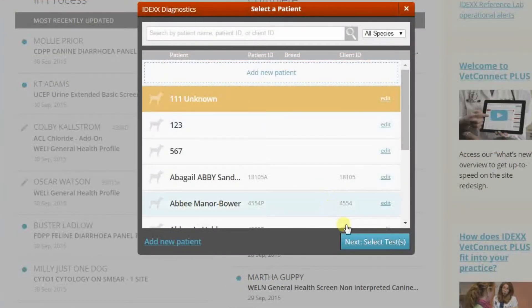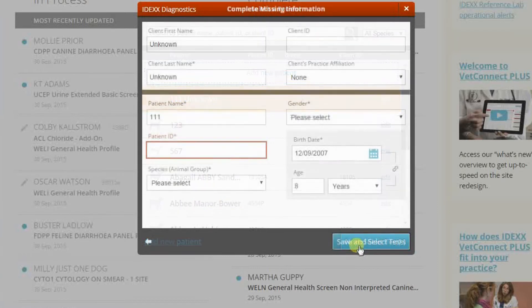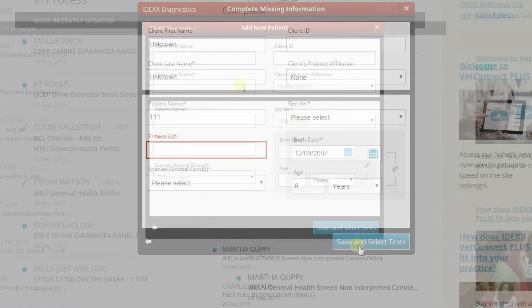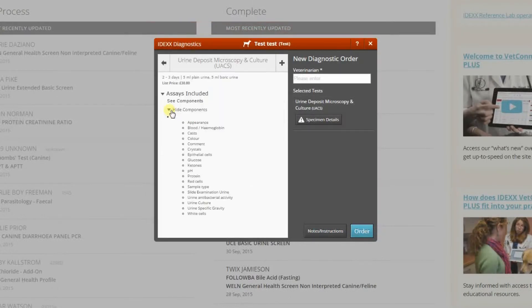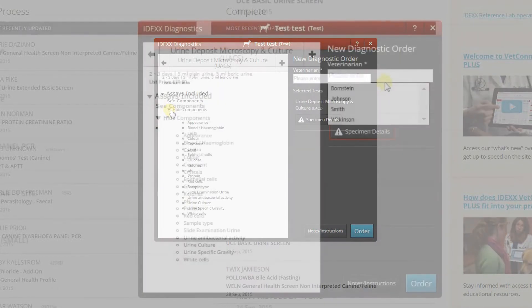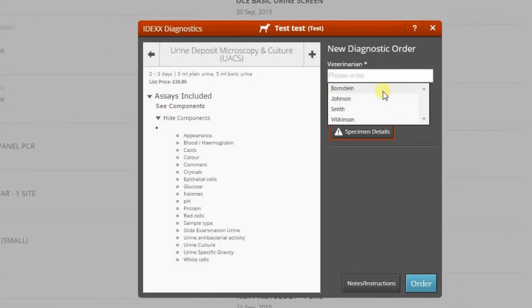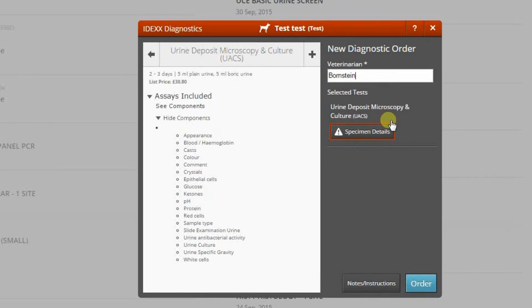If any information is missing, add it here. If your patient does not exist in VetConnect Plus, select the Add New Patient button and complete all required fields. Now select the tests.